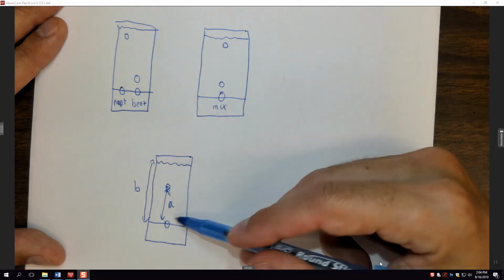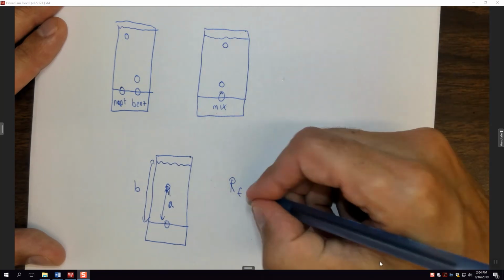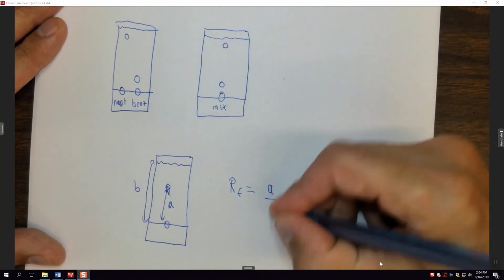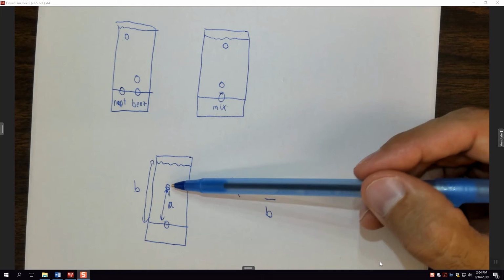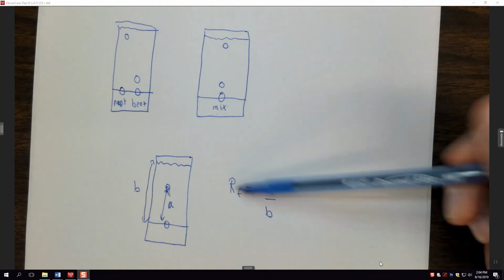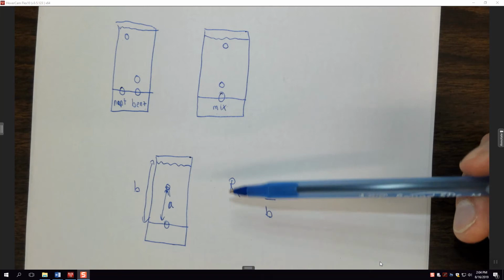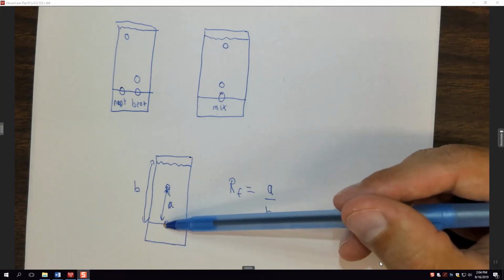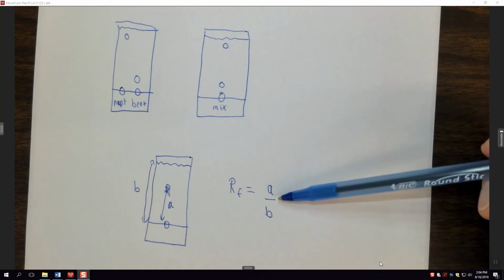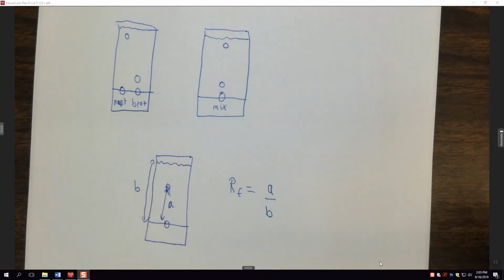To quantitate this, we calculate something called the RF, or the retention factor, and it equals A divided by B. It's essentially a proportion. So this one looks like it's 60%, so the RF would be around 0.6. You can measure this, usually in centimeters, using a ruler. So you measure from the line that you make where you put your spots to the center of your spot, that gives you A. From the line to however far the solvent traveled, gives you B.